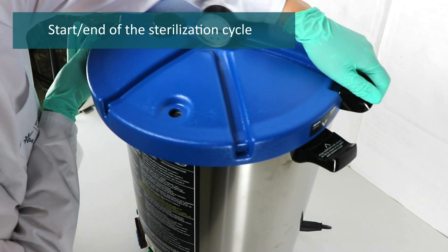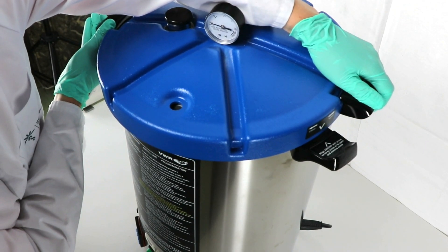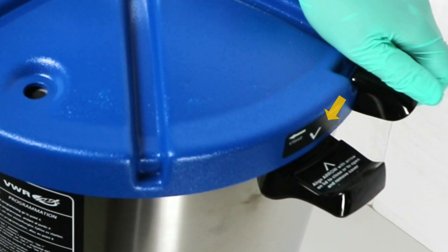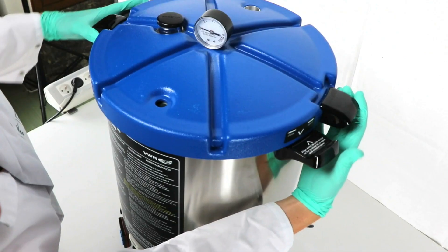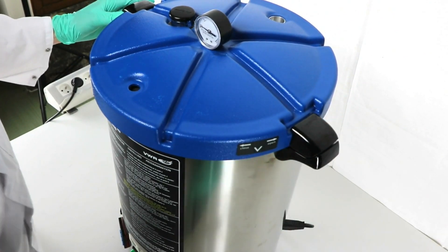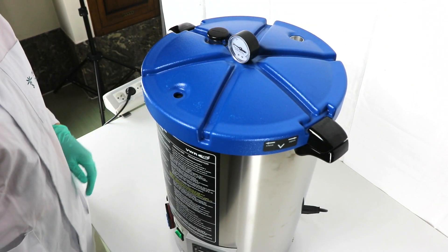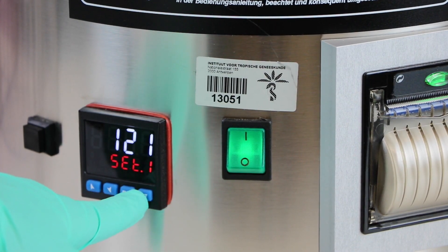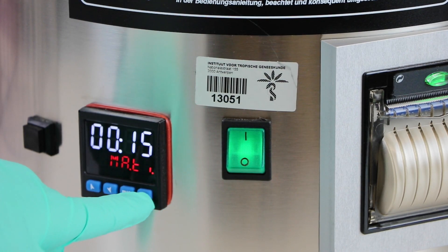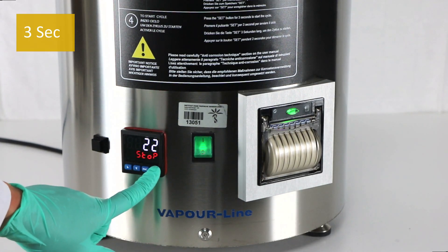Start and end of the sterilization cycle. Close the autoclave: place the lid on the vessel by aligning the V arrow from the lid to the correct place on the vessel. Turn it in the indicated direction until the handles of the lid and the vessel are aligned. Do not rotate the cover beyond this point. Verify the parameters again before starting the sterilization cycle.